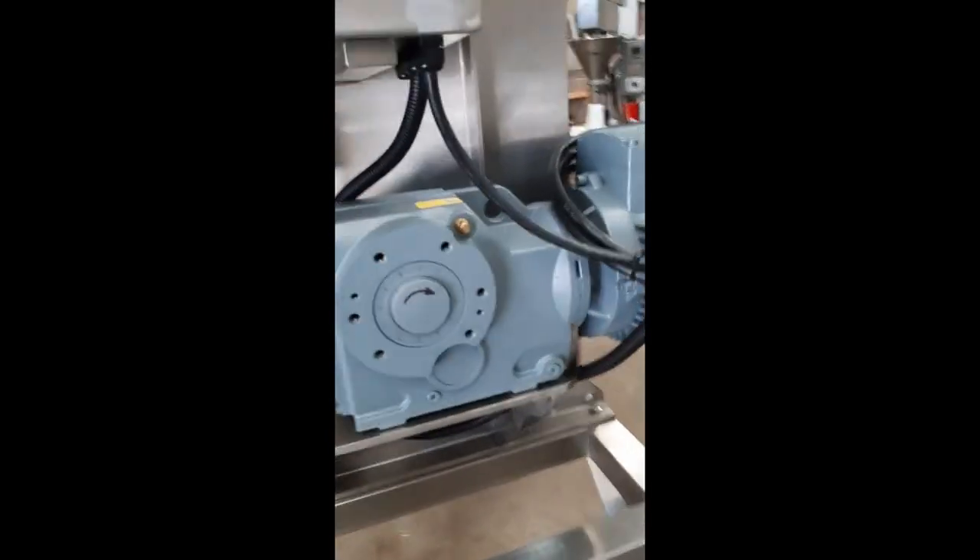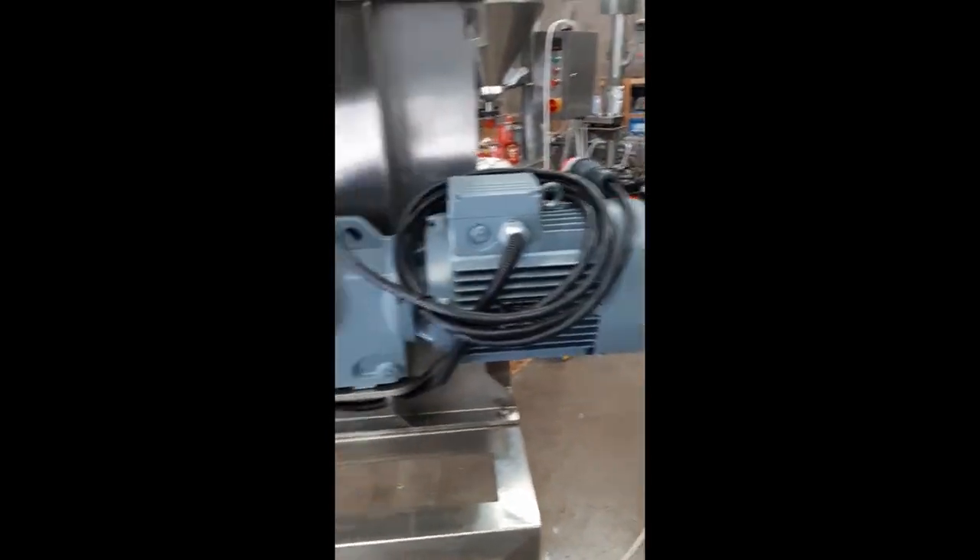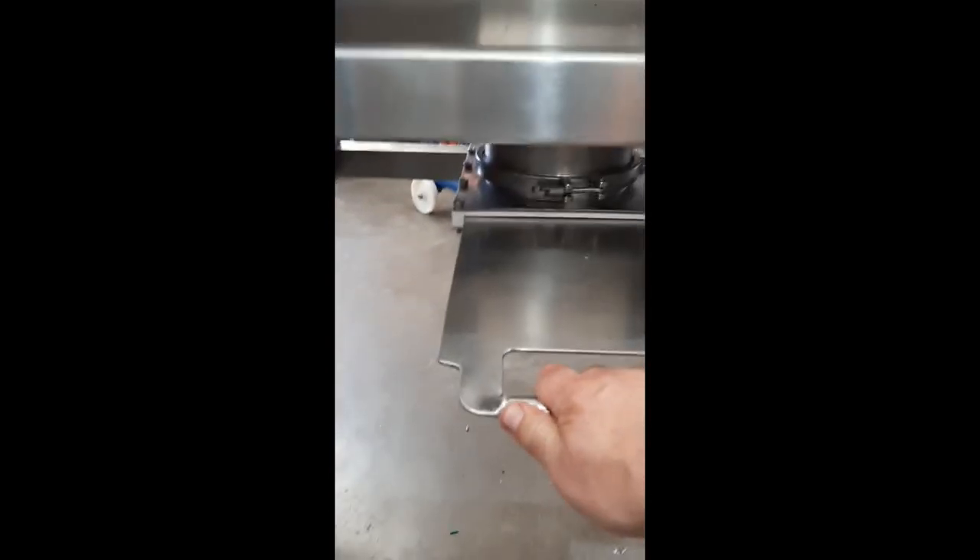Schneider electrics, four kilowatt worm drive gearbox motor. This one has a manual slide valve discharge.